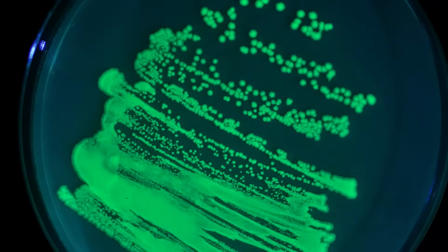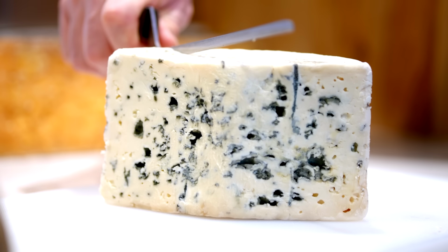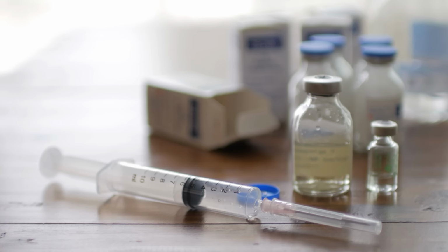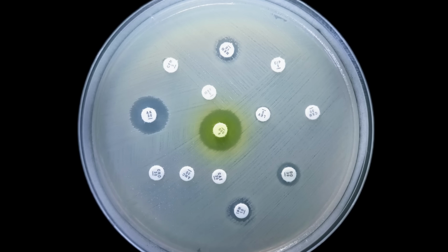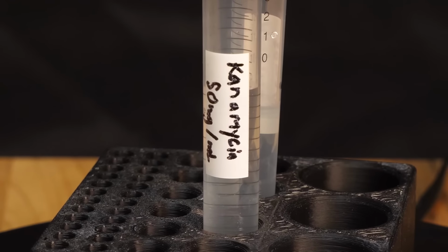Many of my plasmids are designed to work with an antibiotic called kanamycin. I like this one for two reasons. First, I'm allergic to penicillin family drugs, so I don't love working with ampicillin, which is what many other plasmids use. Secondly, because penicillin has been around for so long, many of the microbes in the air around humans actually tend to be resistant to it already. So you'll have much more of an issue with contamination with ampicillin than you will with kanamycin.